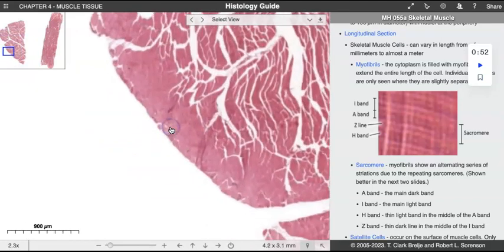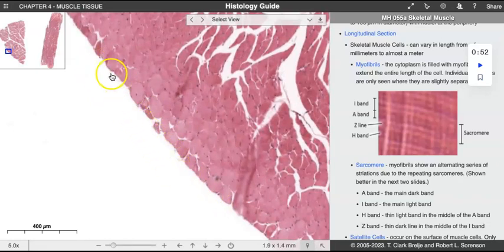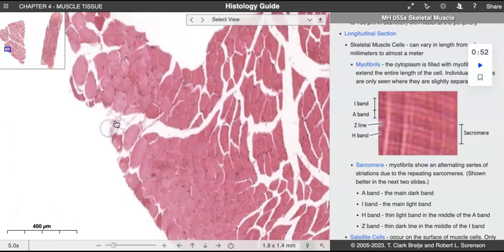And so if we go in with a higher magnification, do we really see connective tissue out here? We really don't. So I'm wondering if maybe one of the other slides they're offering, especially the whole muscle group, may have an epimysium that is there. But then you can start to see some of the stringy material, and that really is the connective tissue.